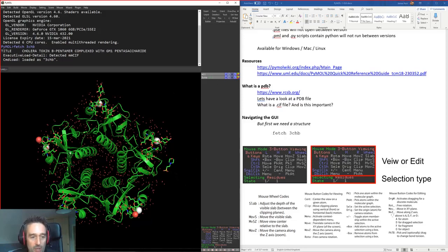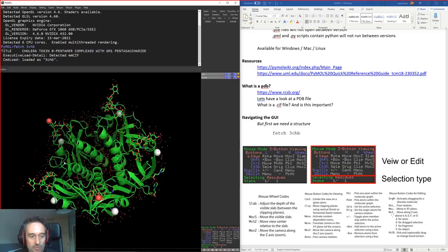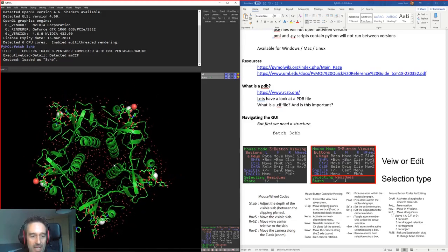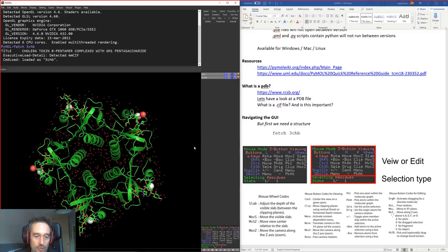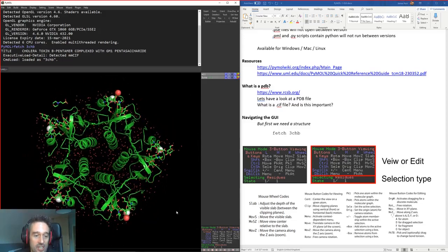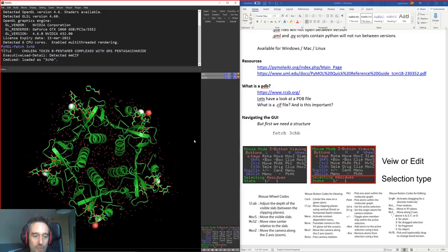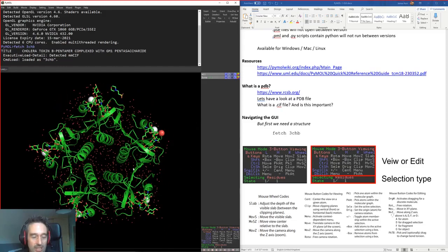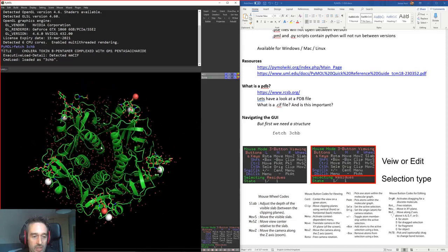So here we are, we're in PyMOL. I'm using my 3-button mouse. If we left click and drag, we can rotate our molecule around. If you have it in a nice position and you want to keep your z-axis, which is looking straight down the middle of the protein, and we left click and drag on the right hand side or on the top side, or basically just one of the sides, you can see that now while I'm rotating here, I'm actually rotating around the axis that I'm looking down. That can be useful sometimes when you're orienting yourself.